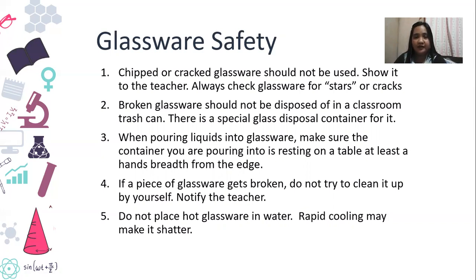If a piece of glassware gets broken, do not try to clean it up by yourself. Notify me or the lab custodian. Do not place hot glassware in water. Yes, please don't do it. After using or heating a test tube and you want to wash it, please have it rest for a few minutes. Let it cool down before washing it. So we're not in a hurry.